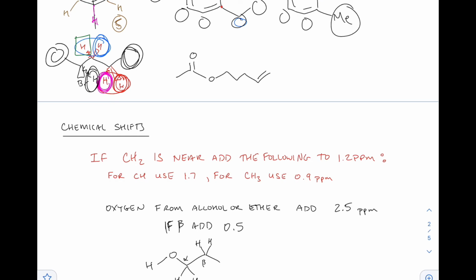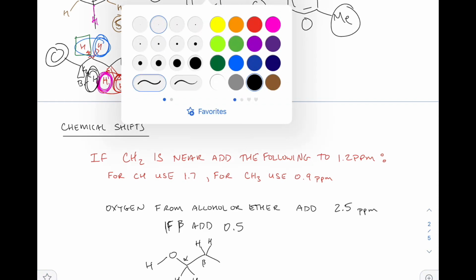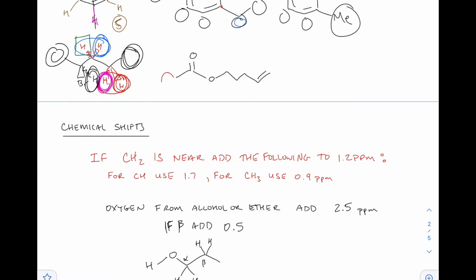Cool. Think about it before you follow up on that question. Okay. I gotta think about this one. So I want to just jump into it and say 2, 3, 4, 5, 6, and then 7.